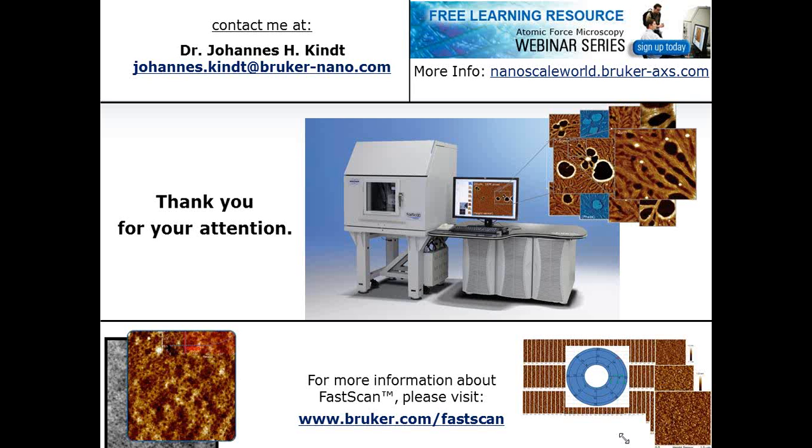So there are certain classes of samples. If you want to take a photograph of a whole ant, for example, then SEM is your technique. But as soon as you come into roughnesses that are in the range of a couple of microns, the AFM comes into view.